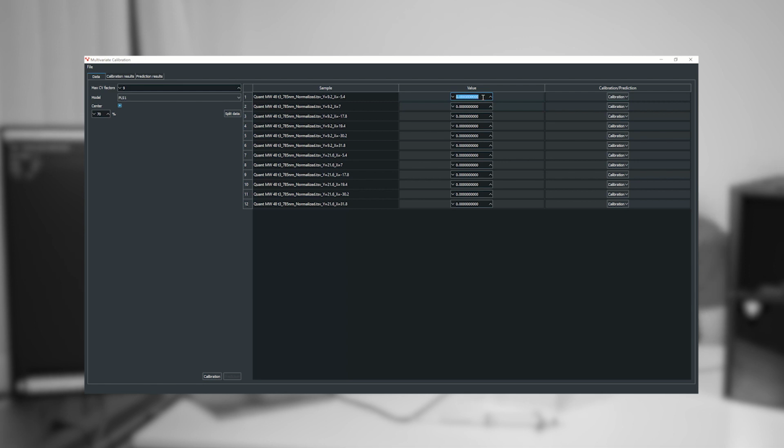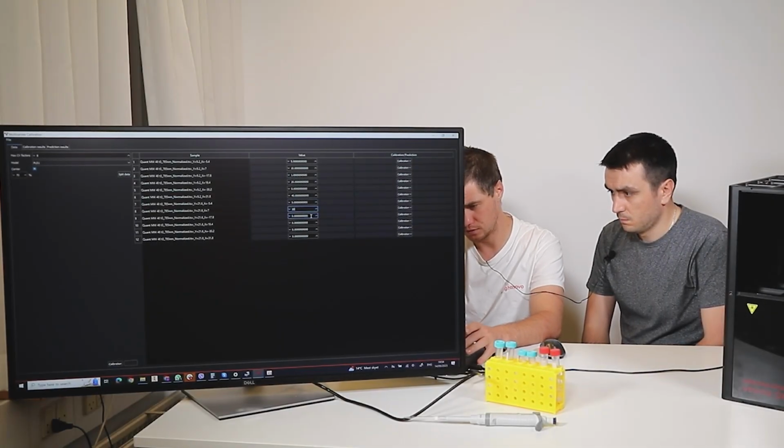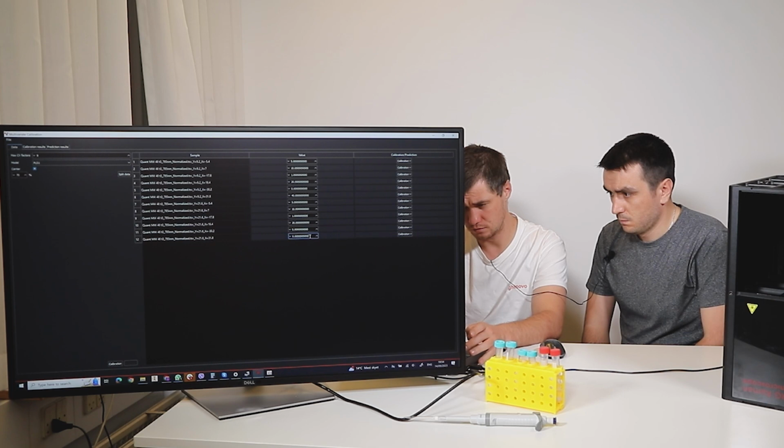The first one is 5% and 10, 1. I look at the positions which attach to multi-well numbers, like A1, A2, and so on. 20, 0, this last one is 40, and then the second line, like A2, B2, and so on. Again, 5, 10, 1, 20, 0, and 40.